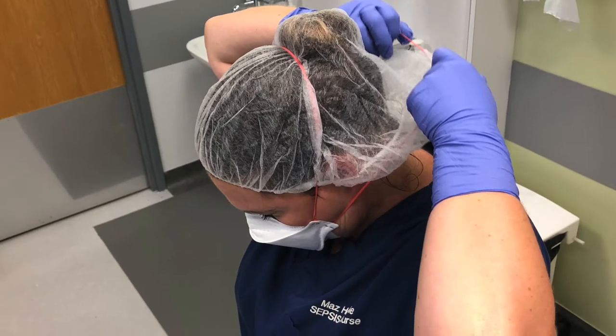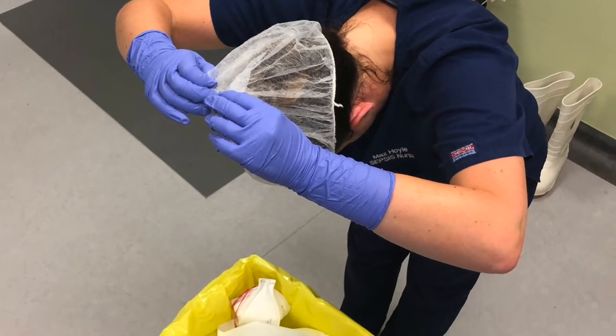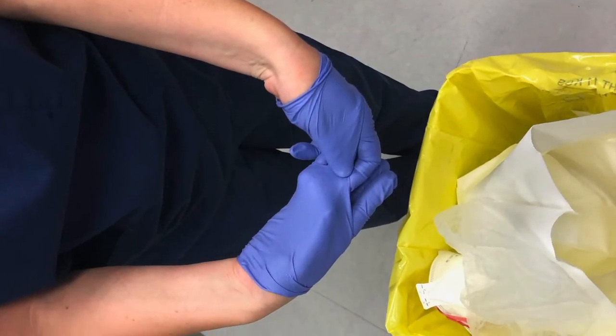Close your eyes and remove your face mask, only touching the straps. Dispose of it in the bio-bin. Repeat this process again with the hair net. Finally, remove the final pair of gloves and wash your hands thoroughly.